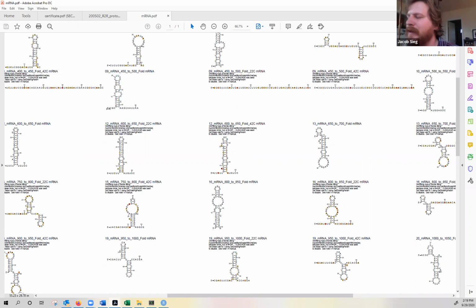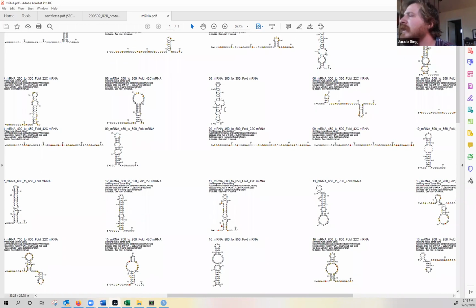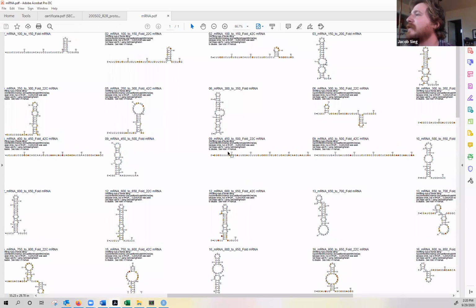And that only took us 15 minutes. You can open this PDF up in Illustrator or another editing drawing program and copy and paste the structures that you actually want to put in a figure or put up on a slide in a presentation or on a poster, and set the legend next to it and all that stuff. And obviously you don't have to spend hours and hours drawing all this. So that's the end of my tutorial.